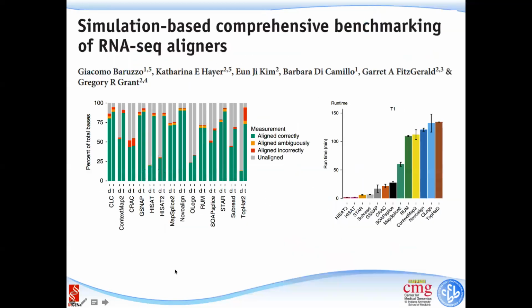Also always keep in mind that there are published results, using simulated data or real data, to test the efficiency and how well each alignment algorithm works. It's the same for all the other methods I have introduced.